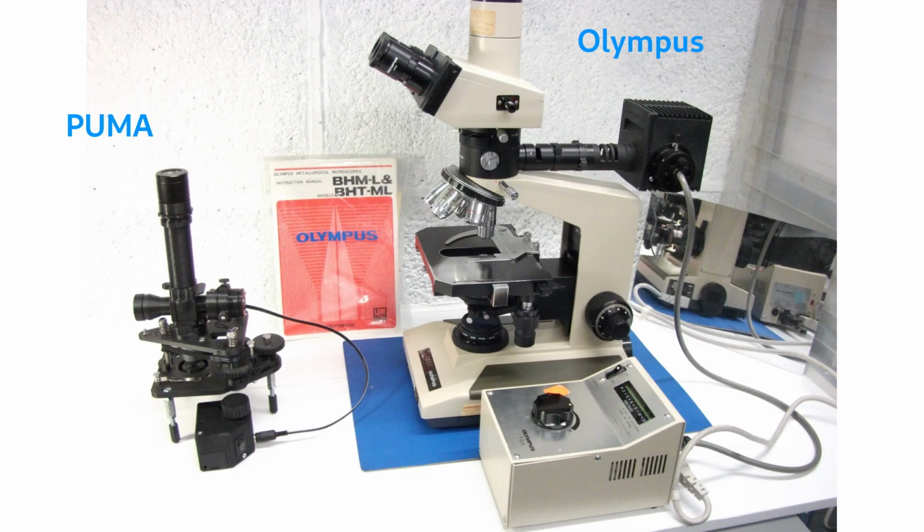Now I'll demonstrate PUMA as a reflected light microscope. I'll also show a comparison of some of the PUMA results to images of the same specimen taken with the same camera using this professional Olympus BH2 BHT-ML metallurgical Epi-illuminator microscope.